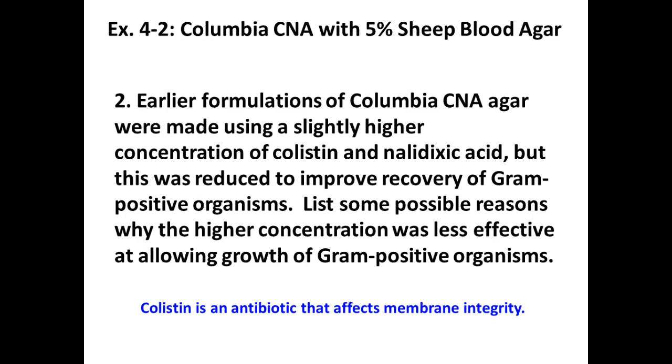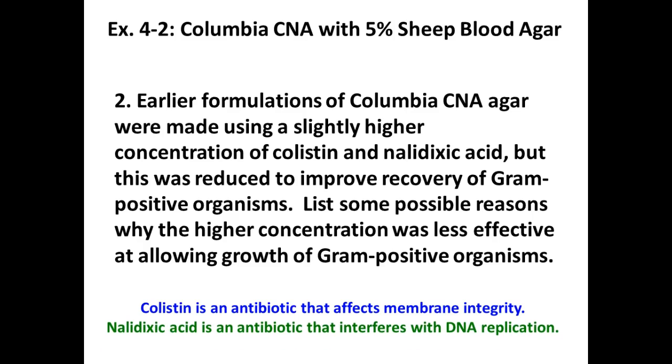So again, in too high of a concentration, even our gram-positives could be negatively affected by that antibiotic. And nalidixic acid interferes with DNA replication. And all cells do DNA replication. If this can get into the gram-positives, it could cause a disruption for them as well. So these aren't strictly antibiotics necessarily for gram-positives versus gram-negatives in how they work if you don't use them at the right concentrations. Right? So concentration really matters.